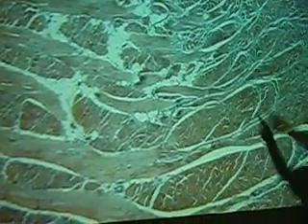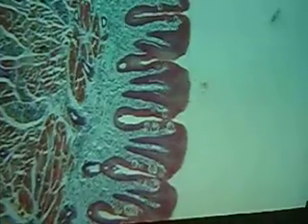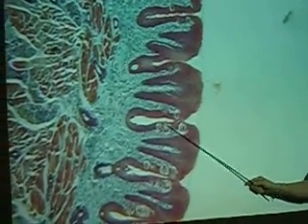It's tipped over on its side, but you can still see the parts. This is the center of the tongue, and all of that pink stuff is skeletal muscle. Then I go to the surface and show you these bumps, this is normally on the top of your tongue. Papilla. Yeah, each bump is a papilla. What do you call the little circles?